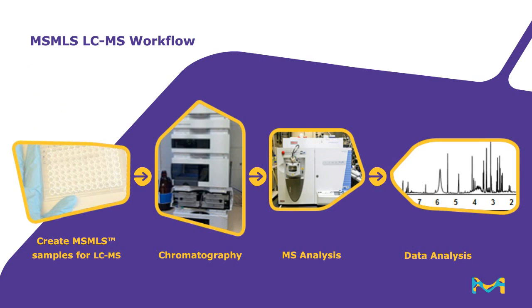So this next slide here shows a schematic of the MSMLS workflow. First, samples are created and then analyzed using liquid chromatography and mass spectrometry, and then finally data analysis. And I'll discuss all of these individually.